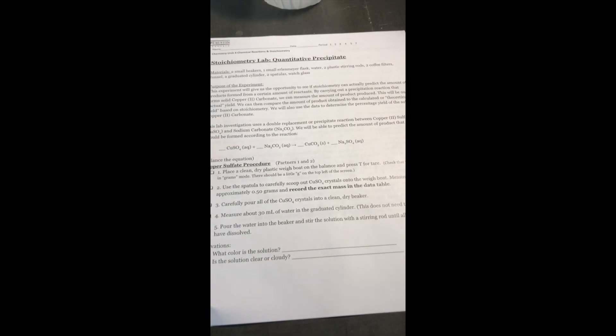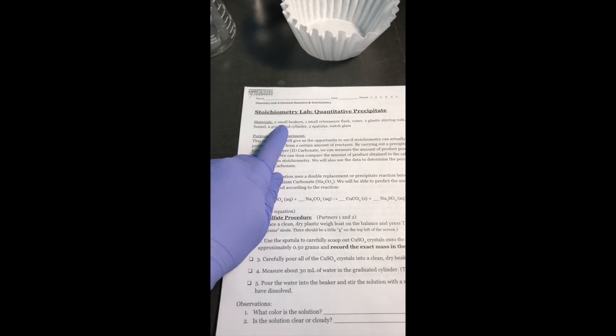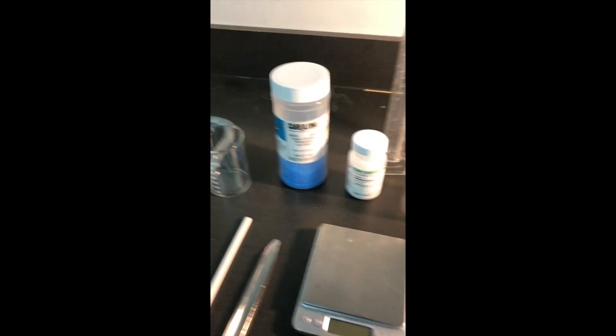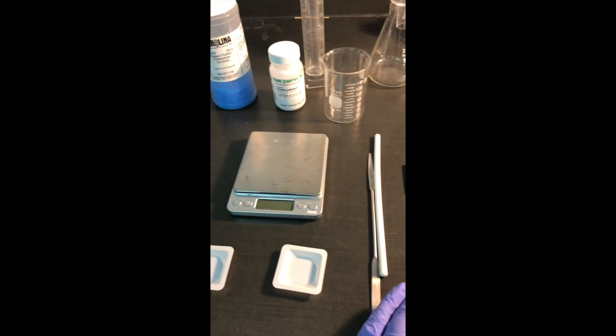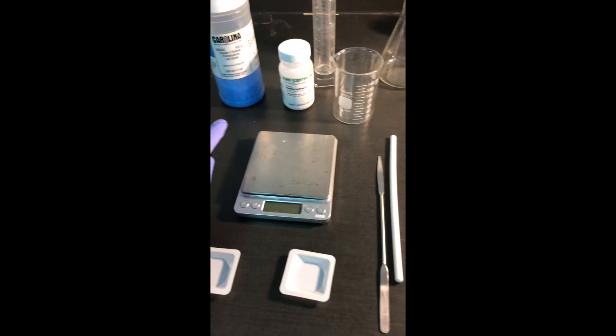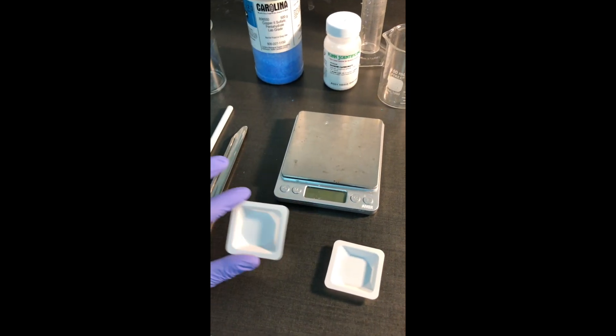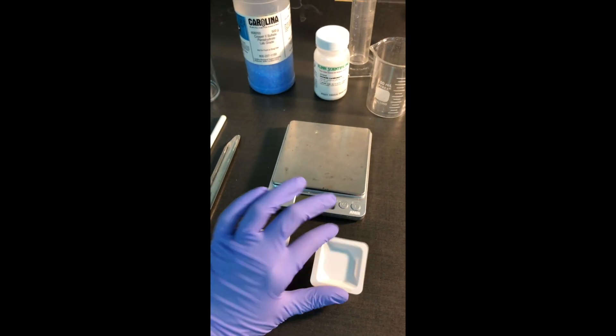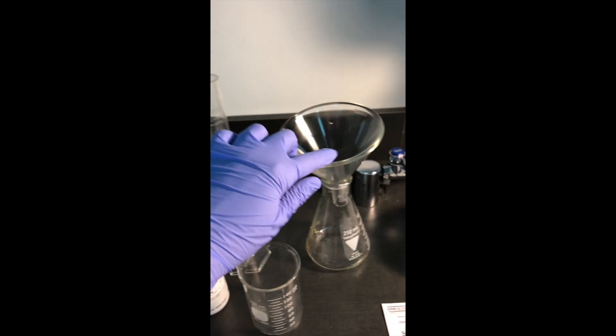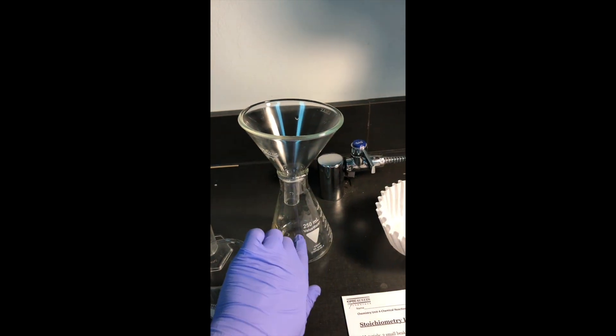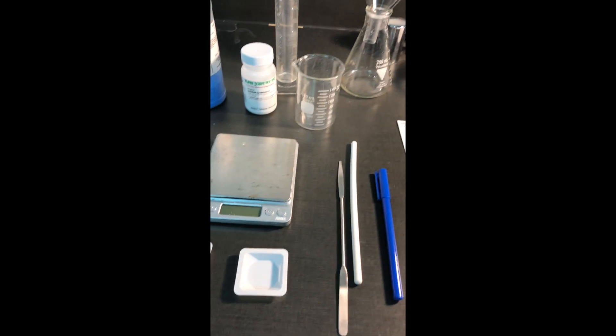Let's first make sure that we have all of the materials. We need two small beakers, a stirring rod and scoop or spatula for each of these solutions, two clean dry weighboats, a balance, a graduated cylinder, a funnel, an Erlenmeyer flask, and some coffee filters. That's everything we need to get started.